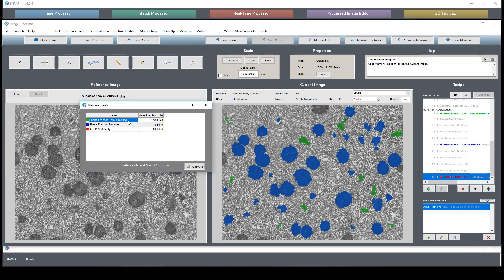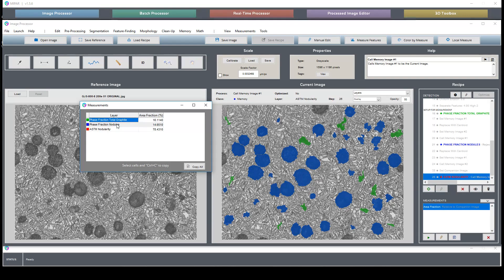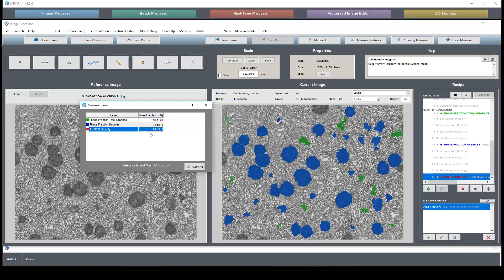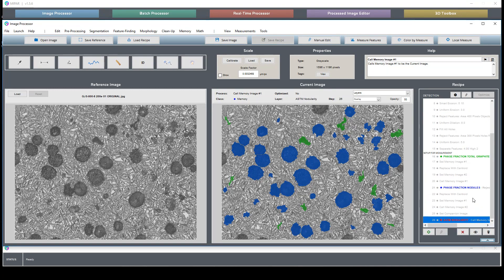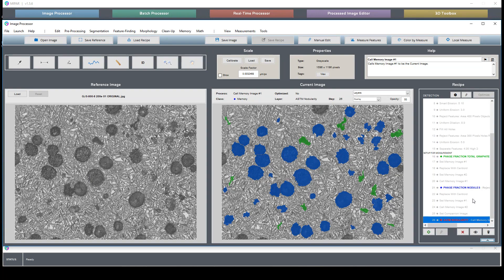We know that this reads an area fraction but that's just simply how it's set up. This ASTM nodularity is rather 78% nodularity. Let's do a quick overview of the recipe itself and then I'll demonstrate the number count.